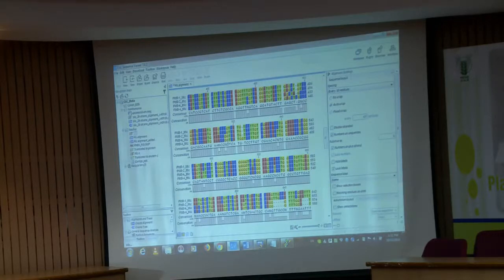But again, now the question is whether this C or G are actually different or it is some misread. So, for that purpose, you will have to go back to your FASTA, those chromatogram files and verify. One by one you have to do. What you will be doing? In the sample number 1 file, this is sample 1, 2 and this is K and A. So, what you will be doing? You just select this sequence, right?